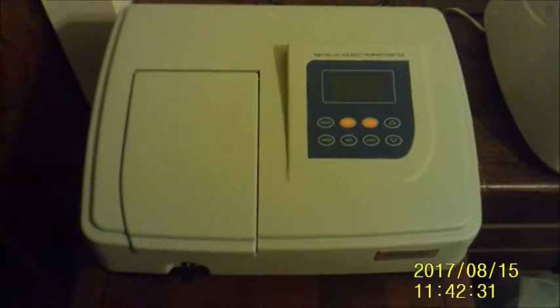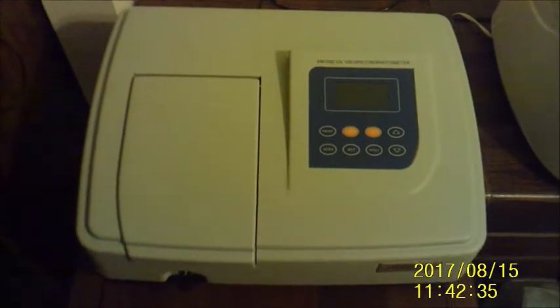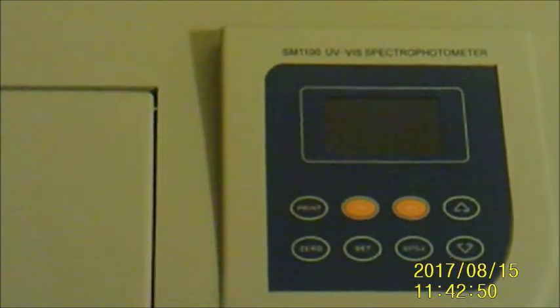Hello everyone. After testing the original spectrophotometer that I had, I discovered that it was a lemon. I couldn't set the wavelength on that machine, and so I sent it back to the company where I had originally bought it, and they sent me a newer model instead. This one works great and is able to do everything that I expect.